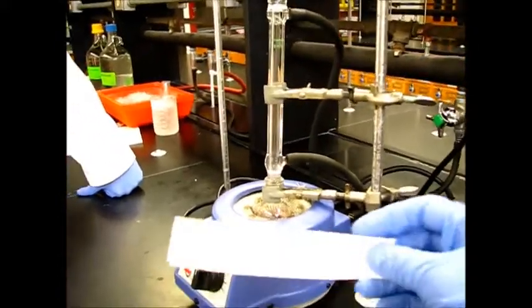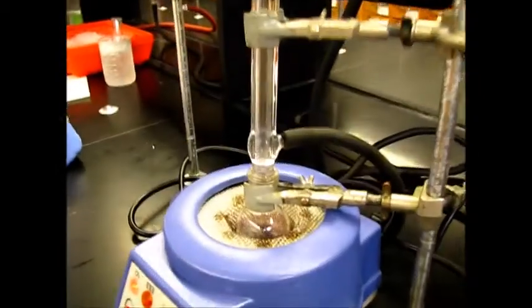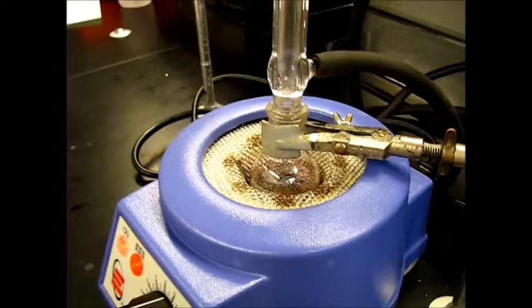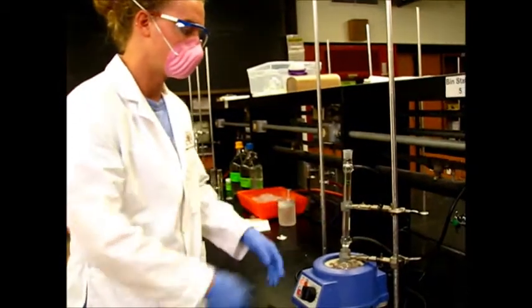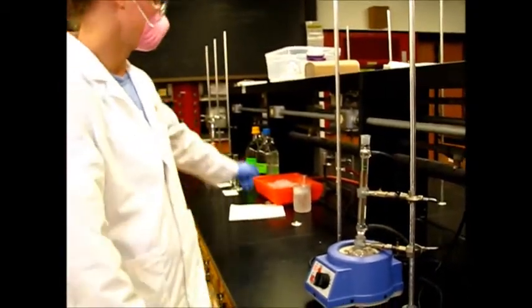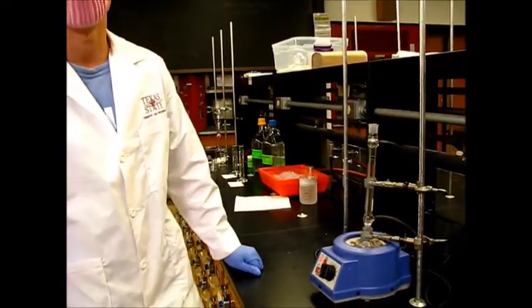So this is after 1 hour, and here you can see it's a dark brown or reddish purple color. So now what we're going to do is go ahead and remove this from the heat. We're going to raise it up away from this heating mantle, let it cool down to room temperature, and put it in the ice bath so that we can get it to a colder temperature for the separation.